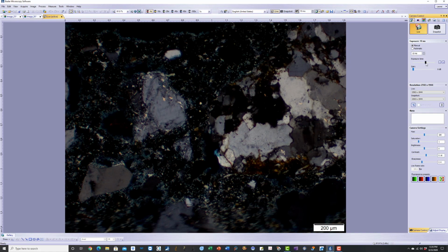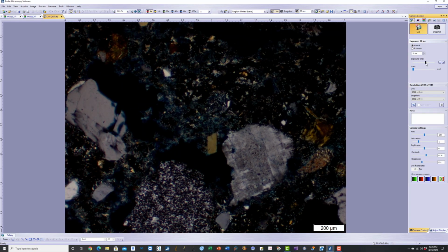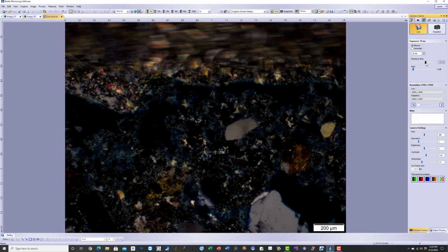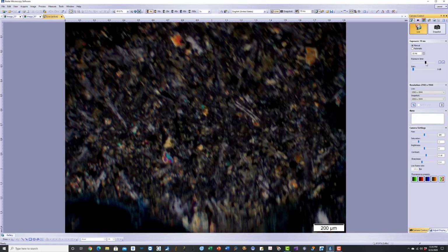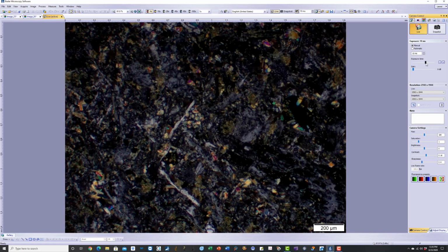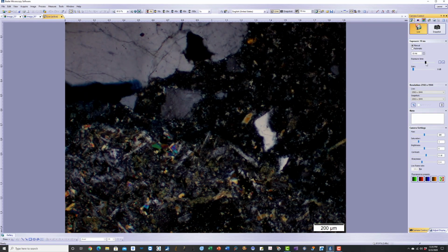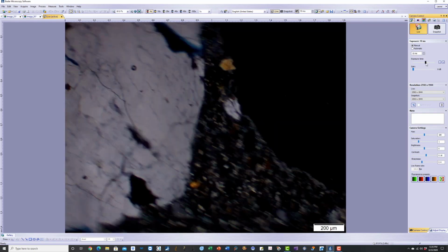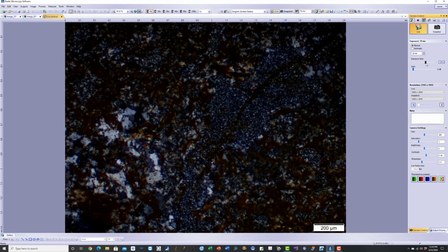Piece of granite. So it's a variety of fine aggregate from feldspar, quartz, chert, granite, volcanic rocks, mostly siliceous sands. Basalt.